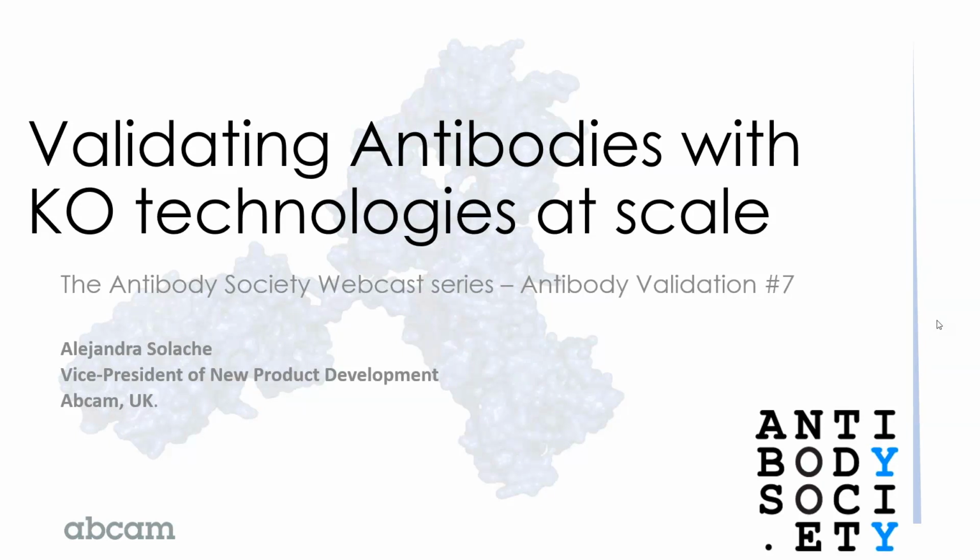Yes, absolutely. Thanks, Simon. And thanks to the Antibody Society for inviting us to participate in this webinar series, as I believe that this is a topic that is key to our scientific reproducibility. And today I will discuss how recombinant antibody technologies, as well as high standards in antibody characterization in multiple applications, particularly utilizing knockout technologies and other validation strategies, can support scientific reproducibility.